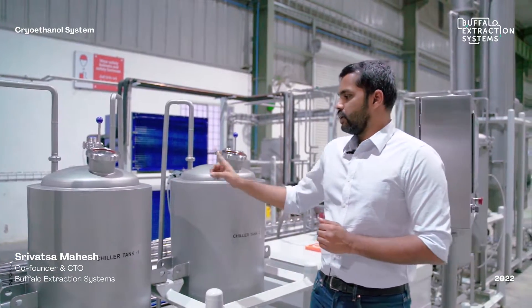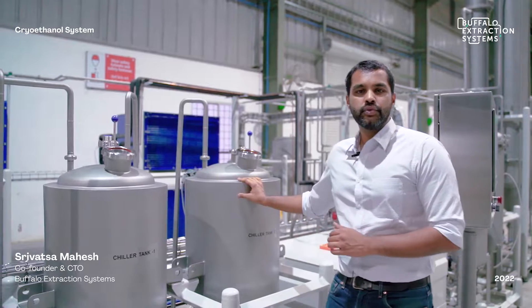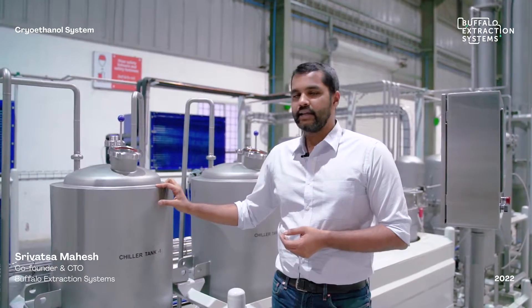There are two pre-chiller skid tanks: one is used as a process solvent — meaning it is in direct contact with the biomass to extract the oils — and the second is used as a utility solvent for jacketing the centrifuge, so that process temperature is maintained in a very stable manner with no increase during extraction.